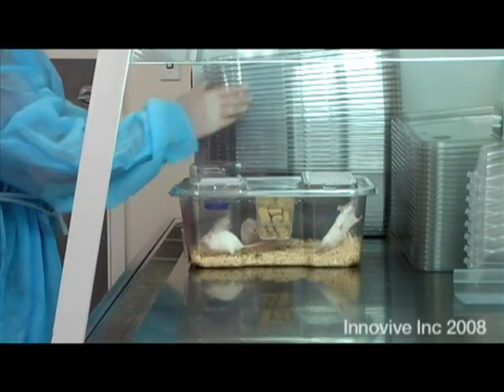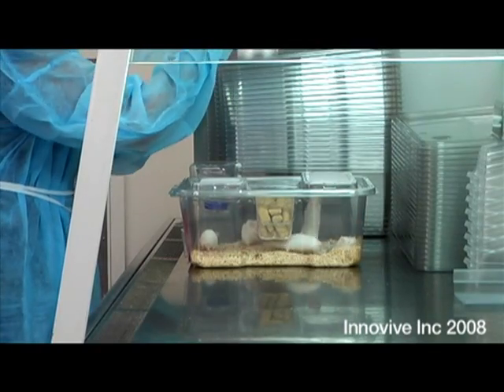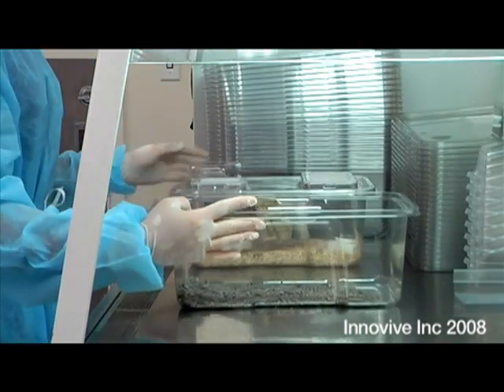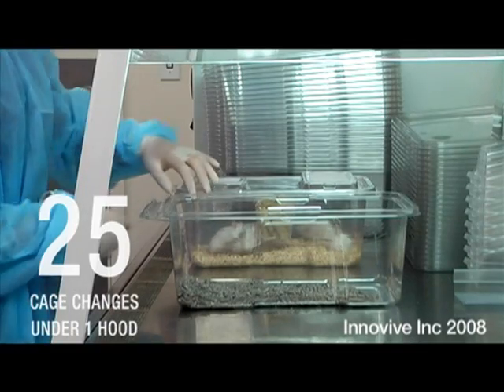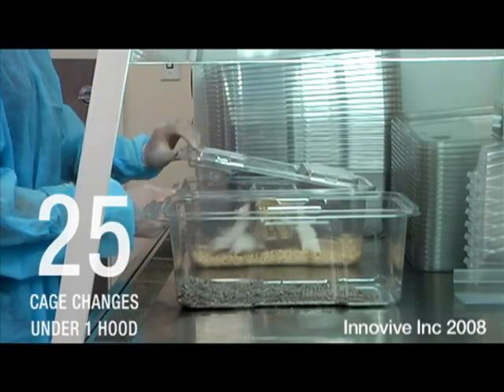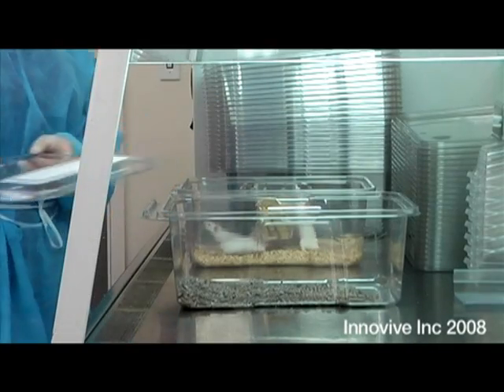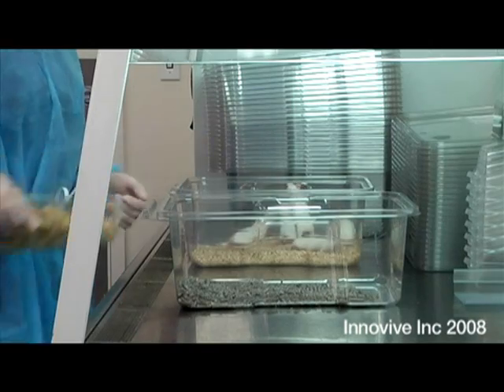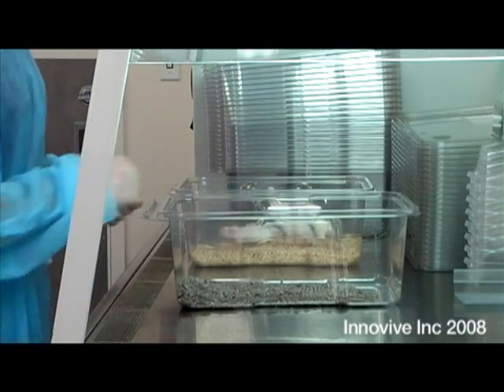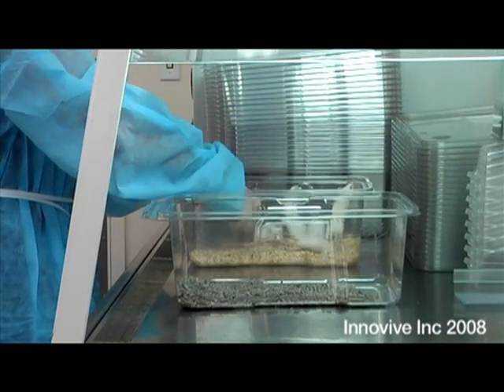The Innovive cage change requires the same steps as a traditional cage change. First, remove the water bottle, then the lid. Using the easy tabs at the front of the cage, used components are easily stacked for recycling. You may provide your own bedding or use Innovive's pre-bedded cages.